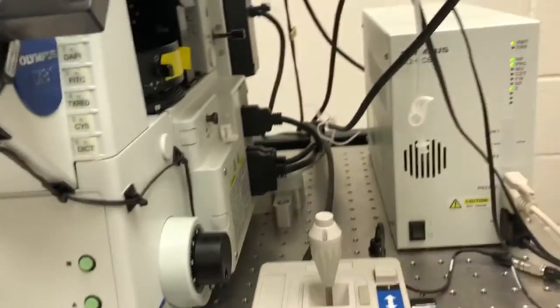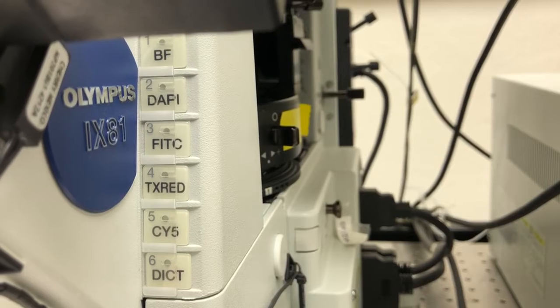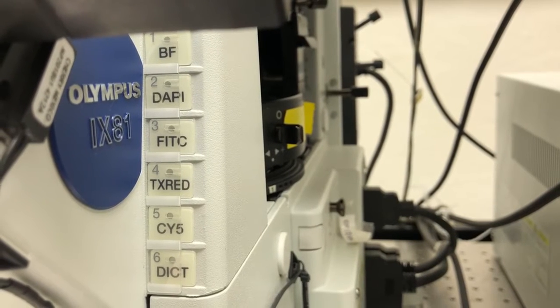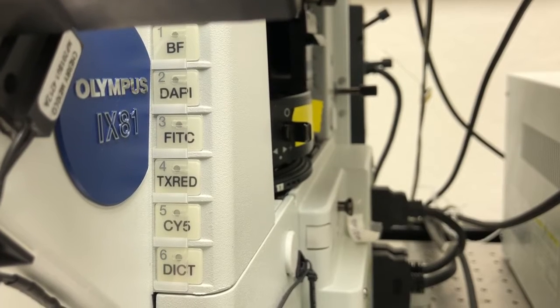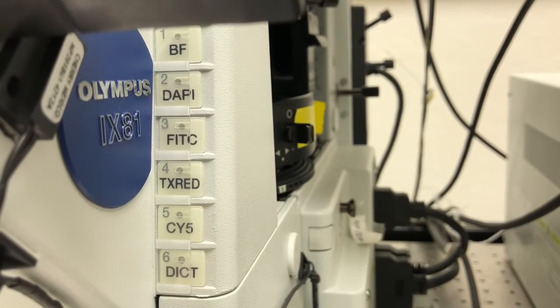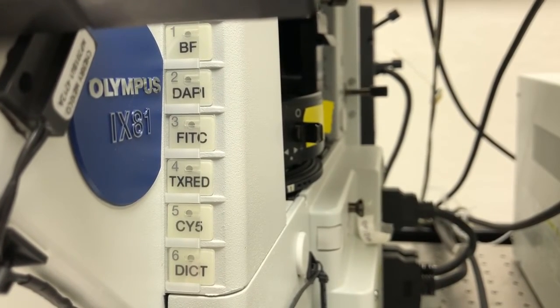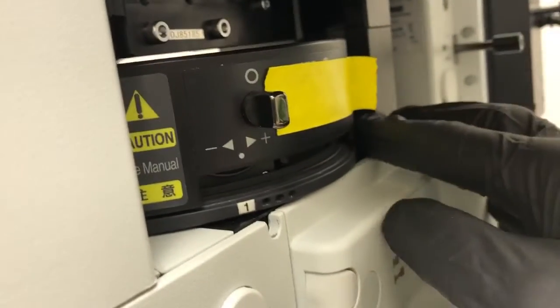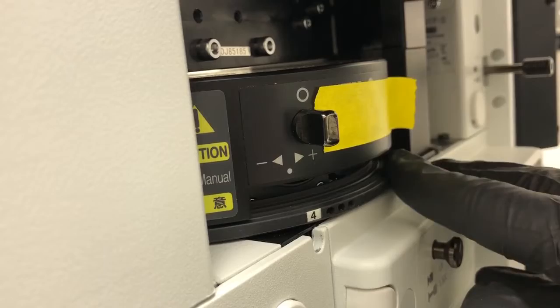We need to make sure that we are using the proper filter cube. If you look here, you'll see the different options. Filter cube two, three, four, and five are for fluorescence illumination. Let's say we want to look at a fluorophore that is in the Texas red range. That means we need to set up the turret to position four. So I'm going to go to the turret here and rotate this until we get to position four.